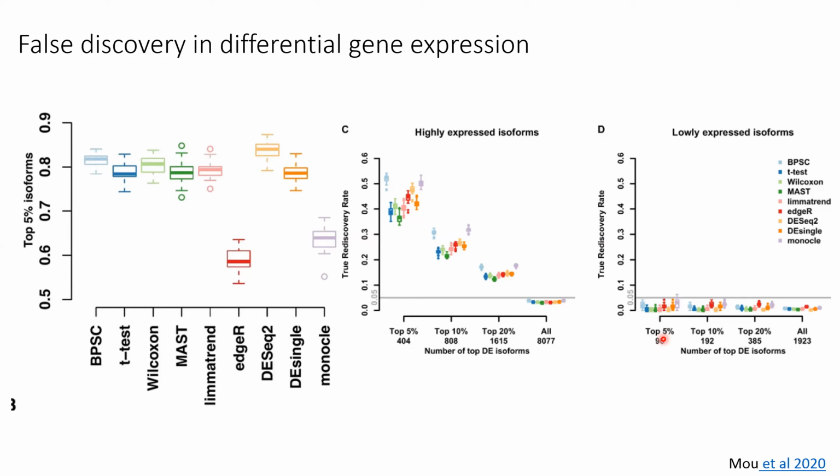The systematic differences between the 2 patient samples, if they're prepared independently, can affect the result of a Wilcoxon rank-sum test. So in theory, it would be possible to work around this issue by doing a logistic regression using the patient as the latent variable. And then as a result, you'd get a p-value for how much each gene contributes to the difference between the 2 cell types after controlling for the differences between the patients.